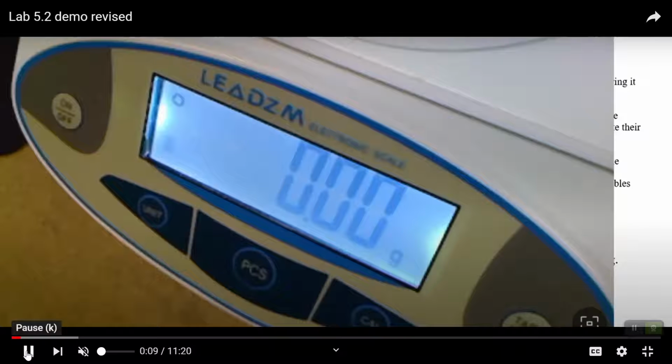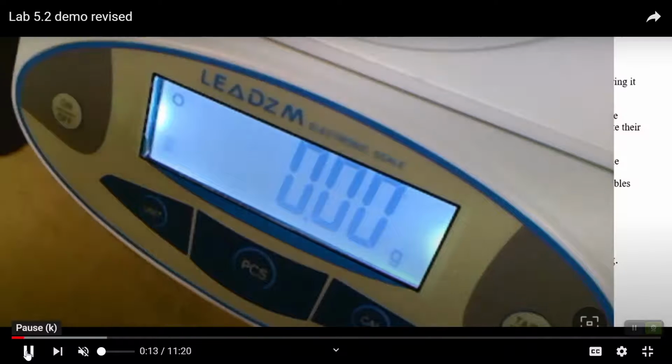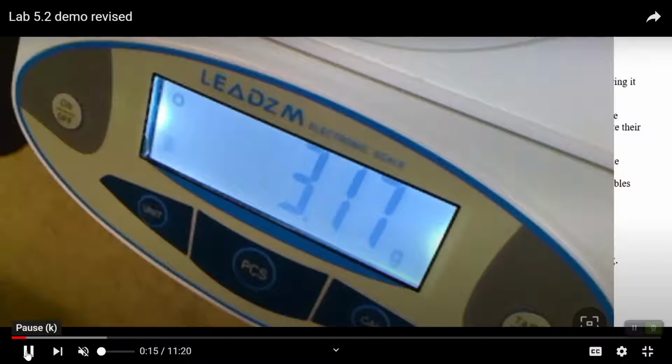So we turn our scale on. I'm going to put a cup on the tray, and we'll tare it so that we get rid of the mass of the cup. And then drop by drop, I'm going to add 100 drops into that cup. At the end of that 100 drops, look at the mass, and that will be the mass of 100 drops. And from that, we'll calculate the mass of 1 drop.